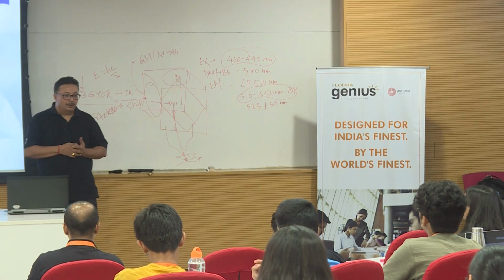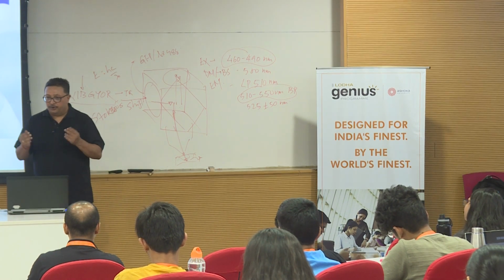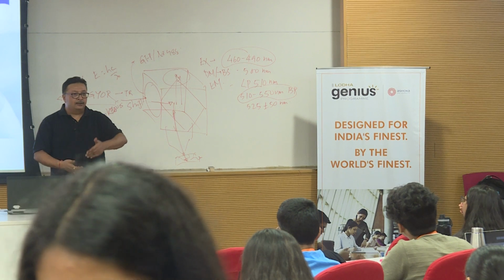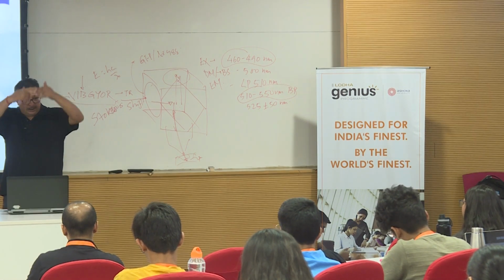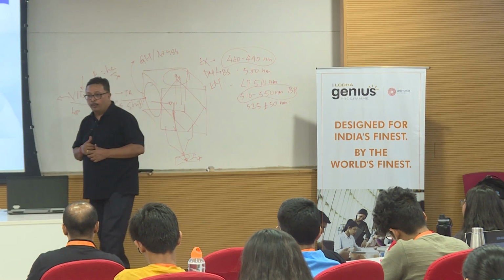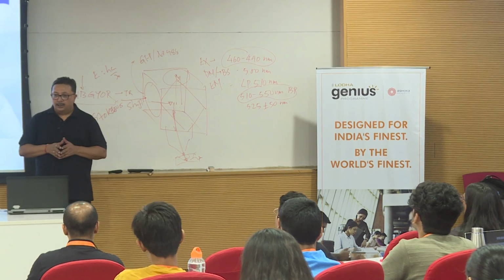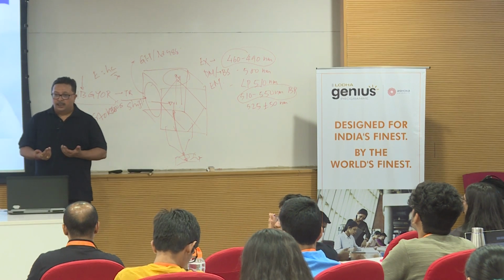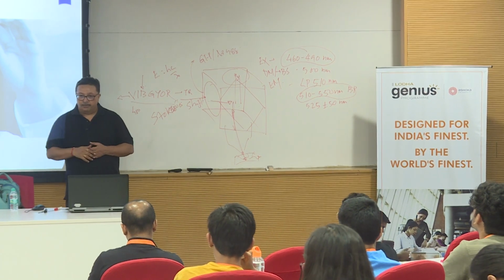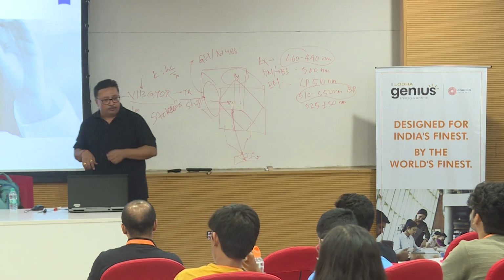What is haze information? Unwanted blur information, out of focus information, which you can't focus properly or see properly. And it is coming because of the scattering of the light in that tissue or in that volume while you are doing depth of penetration imaging or in-depth fluorescence imaging. So you never know that, okay, I have got a good emission signal, but it's a lot of haze. I am hardly able to understand which image is coming from which focal plane. And what is the focal plane? The best focus. The best focus at which you get the ideal information or the in-focus information.